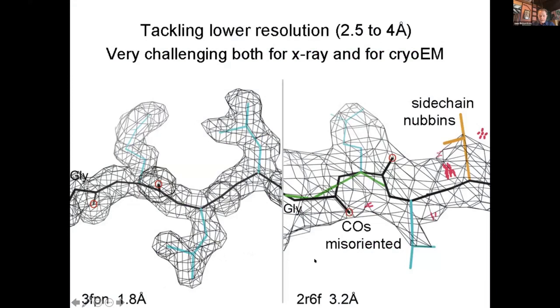This just illustrates the issue: at around two angstroms — this is 1.8 Å — you truly can see the direction and even very cleanly see the carbonyl oxygen, so you really know how to model that peptide. But at three angstroms or worse, you can't see a bump for the carbonyl oxygen at all, and so it gets put in fairly random directions, both by software and by people.